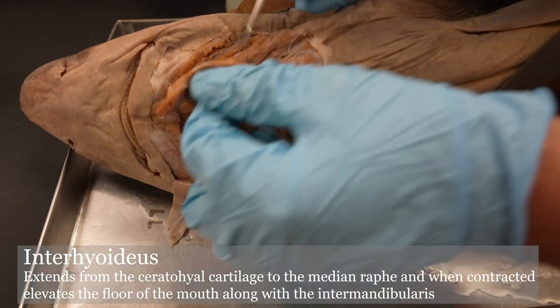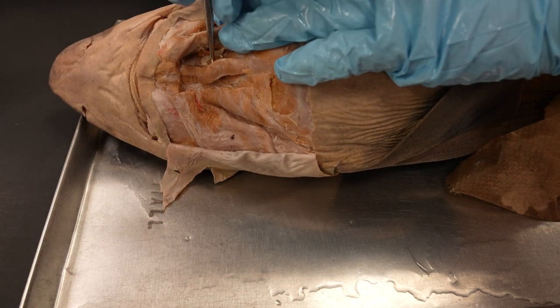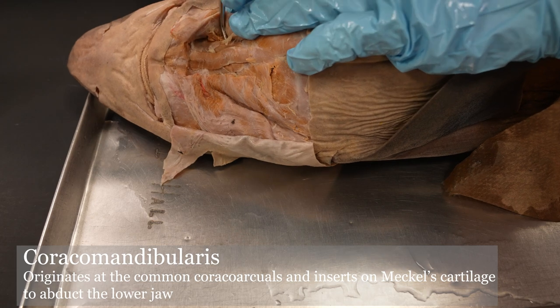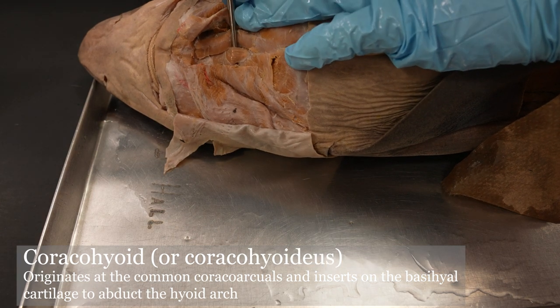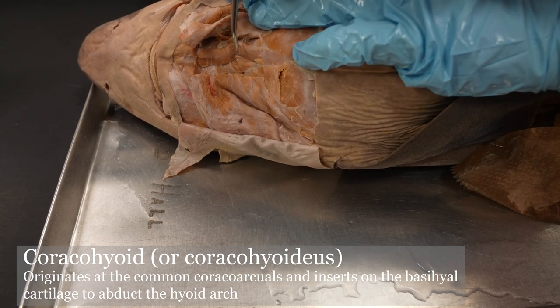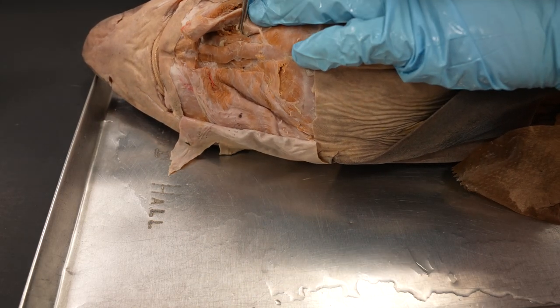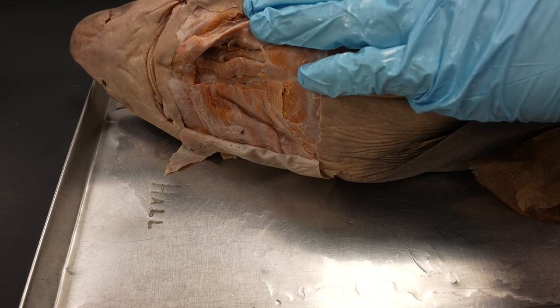Deep to both of those we have two muscles we want to look at. This one is the coracomandibularis — a single muscle down the midline — and deep to that coracomandibularis there are two coracoarcualis on either side. I can't quite get a probe under this one, but there we go. It's also kind of torn up — this shark had had a rough time, a rough afterlife if you will.